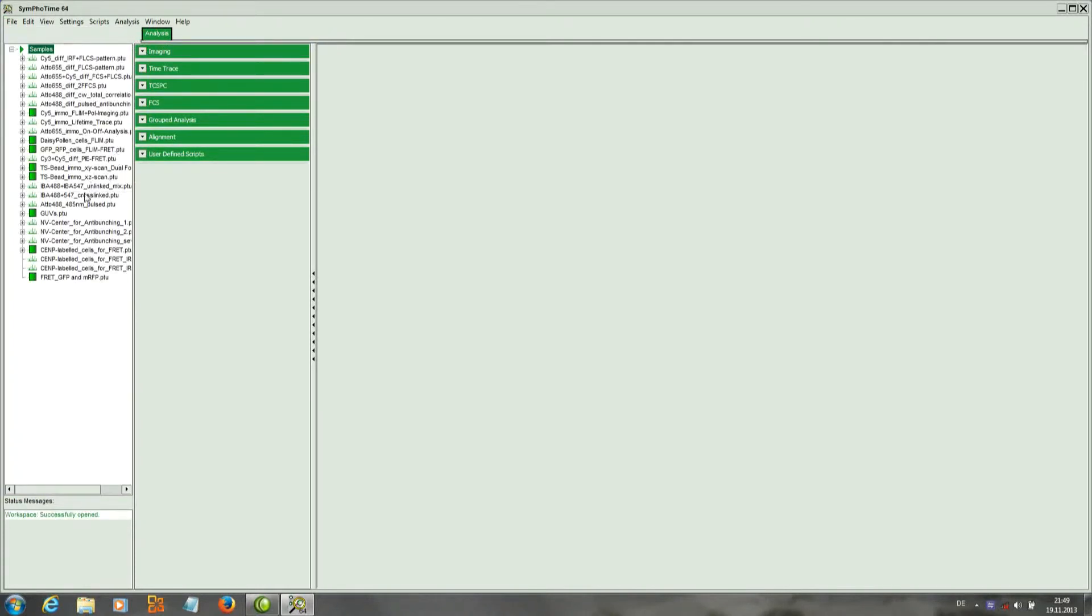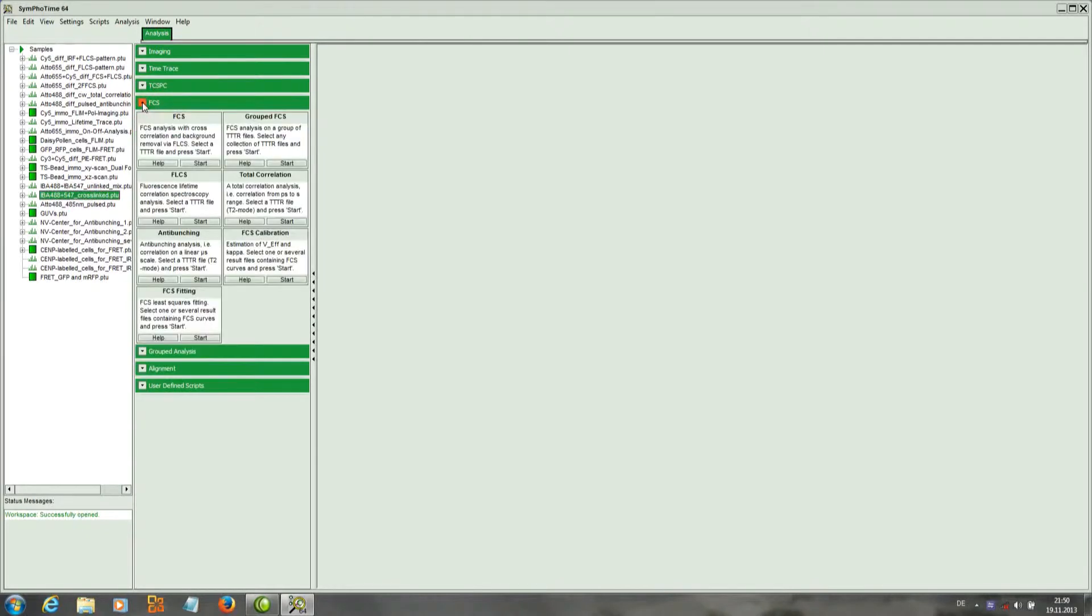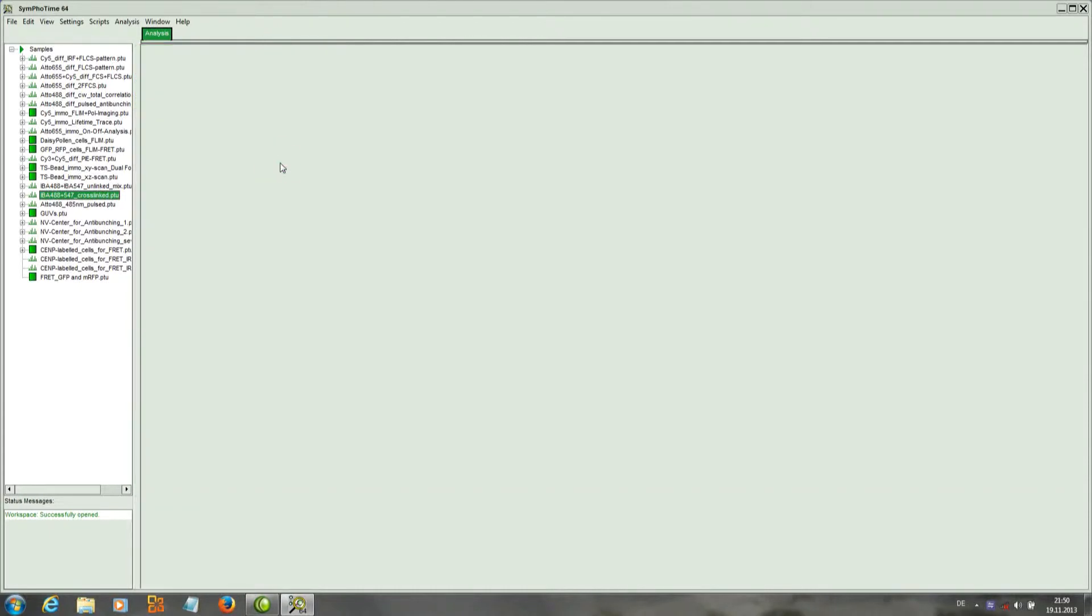First we open the sample workspace and select the file IBA 488 547 crosslinked PTU. We apply onto that file the grouped FCS script.